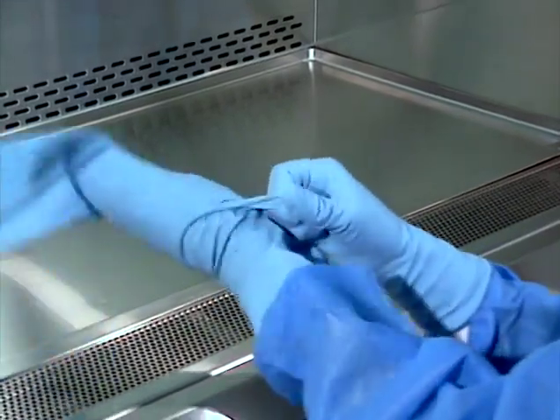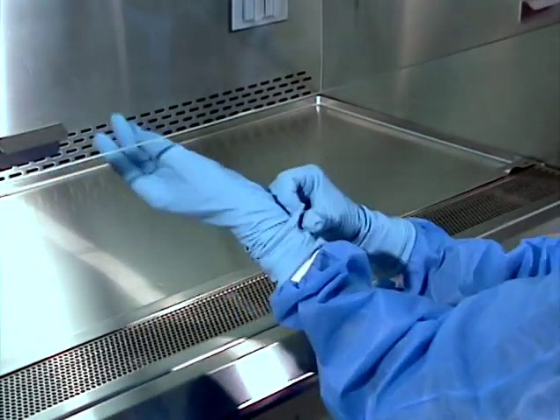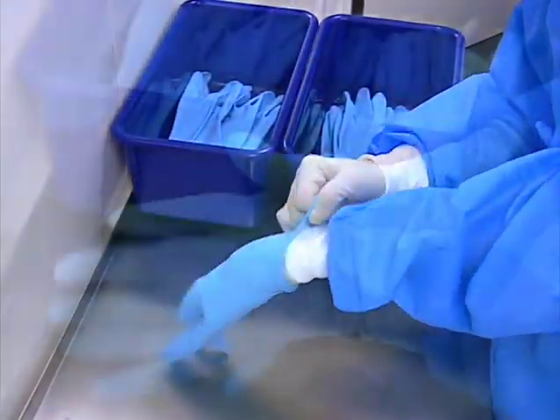Gown as usual for hazardous materials compounding, but add a third pair of heavyweight disposable gloves. The first pair of gloves should be under the gown cuff, and the second and third pair over it.